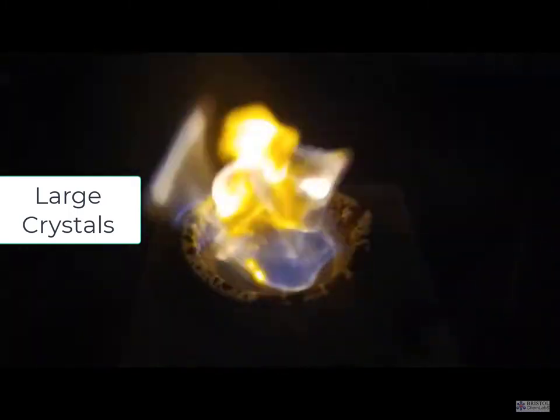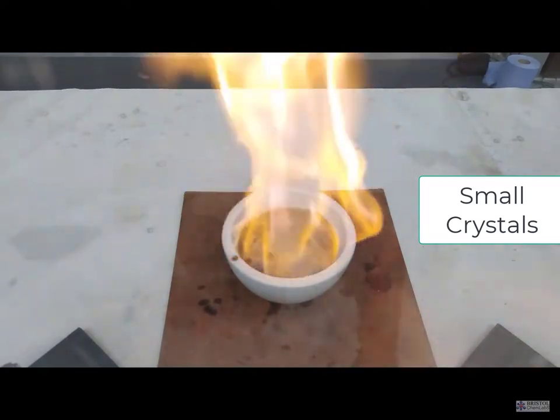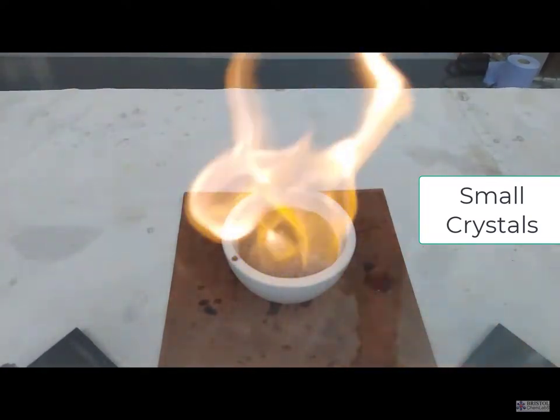The bigger the crystals, the better the effect. The smaller powdered crystals of potassium manganate 7 are much less impressive.